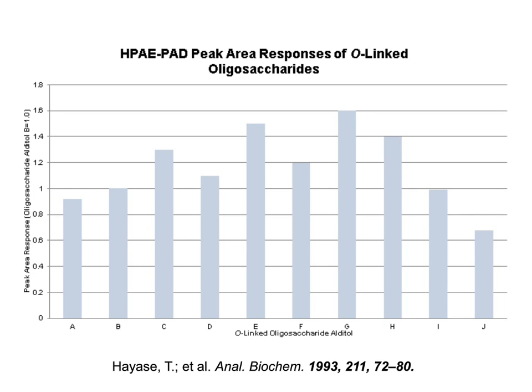Again, there's a wide range of structures, but a pretty close range of response, a less than 2-fold difference in the response. And this is the publication that data came from. I have a lot more in this area in technical note 133.